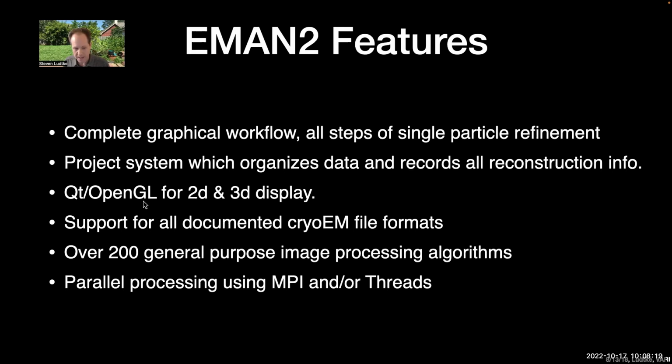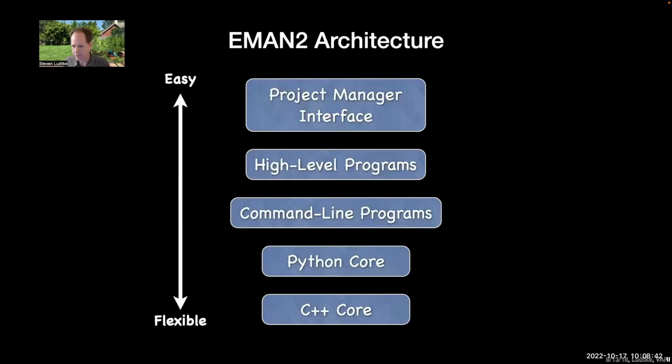It uses Qt and OpenGL for all of its 2D and 3D displays. It has I/O support for basically all documented cryo-EM file formats, so it's good as a tool for file conversion and stuff like that. There's also a bunch of image processing algorithms. All right, we'll move on from this.